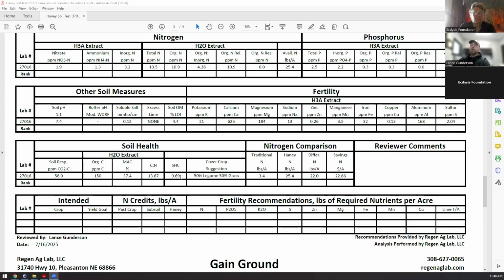Soil health score pushing 10. We jump over, respiration jumped. It's double the first sample. It is 5x higher than the second sample. And you'll notice there's not any more food available here, right? 150. This is one of those cases where as your respiration goes up, soluble carbon has a tendency to go down. Makes sense. The microbes are eating it, right? So there's nothing to panic there.